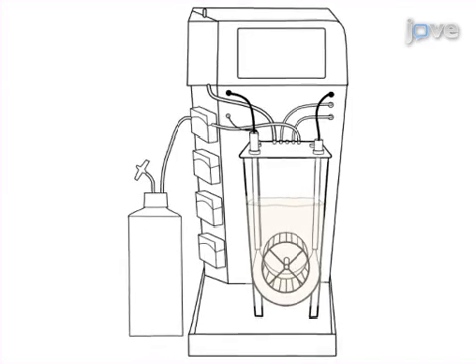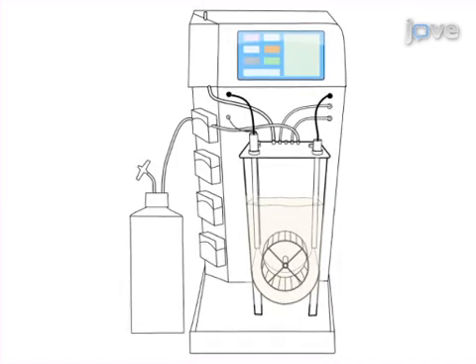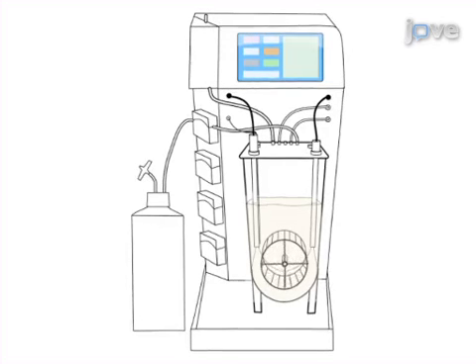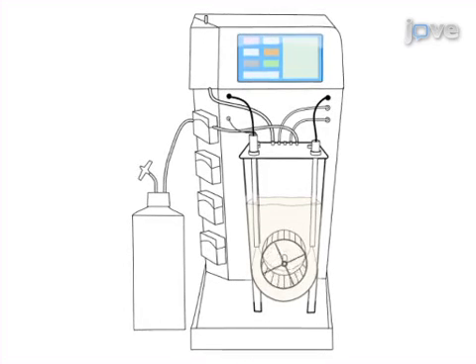The final step is to start the controllers to ensure the bioreactor achieves the desired impeller speed, temperature, and oxygen saturation.